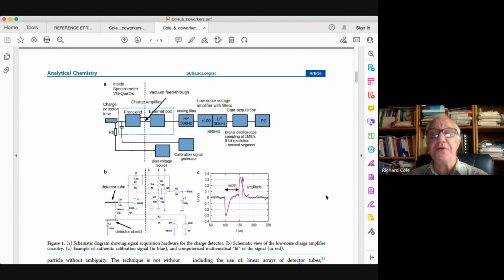It's non-ideal compared to the ideal signal that I showed you on the previous slide. The real data is often a little bit noisy, as shown by the blue line here. The blue curve is the real data.